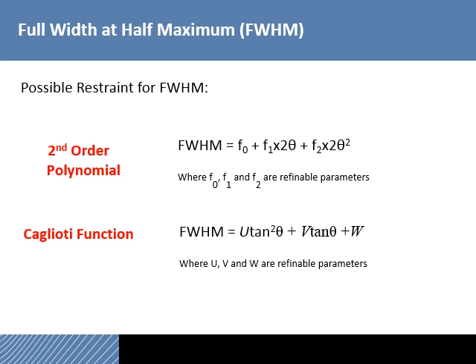So you really, for the most part, want to incorporate F1 and F2 into it. Sometimes for phases in an X-ray diffraction pattern that have very weak peaks where you can't see the secondary peaks, it's just easier to set the full width half maximum at a constant because you can't really see those peaks anyway, and it prevents the Rietveld refinement from sort of blowing up on you.